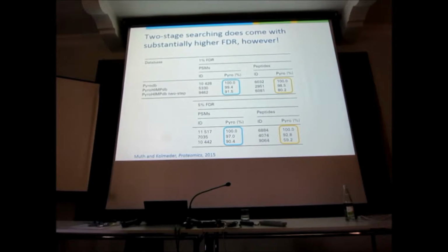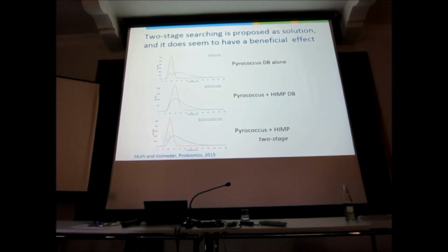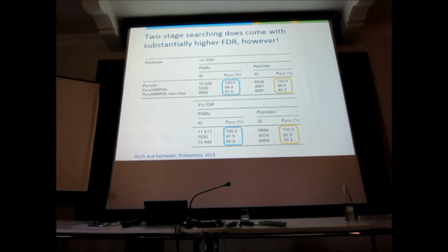We cut off first at 1% FDR. At 1% FDR, when we search the Pyrococcus database, we get 10,000 odd hits, and this is 100% from Pyrococcus. Of course, it's the Pyrococcus database, right? So here, this is peptide to spectrum match, this is peptides. We don't talk about proteins, that's too difficult. You get up to 100%, that's all fine. When you take this bigger database, and that is here, we get half the hits, remember? We halve the number of hits, but 99.4% comes from Pyrococcus. Our false discovery rate is under control. Everything works as we expect it to.